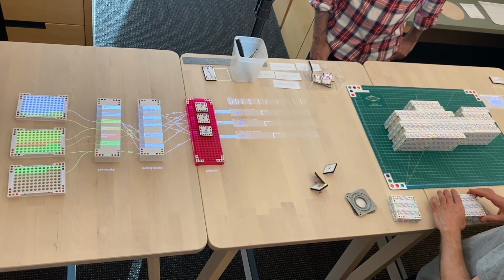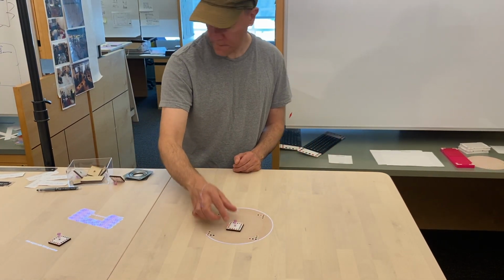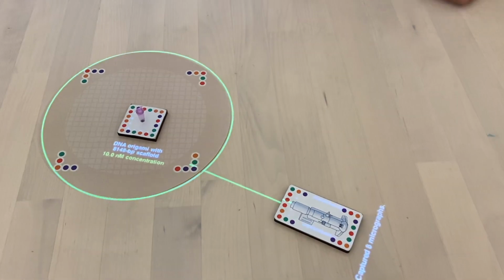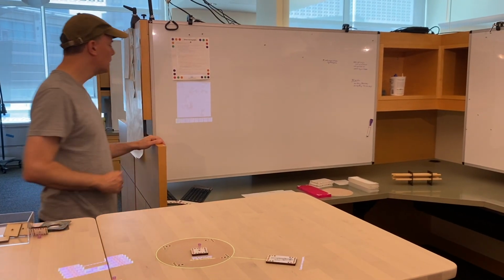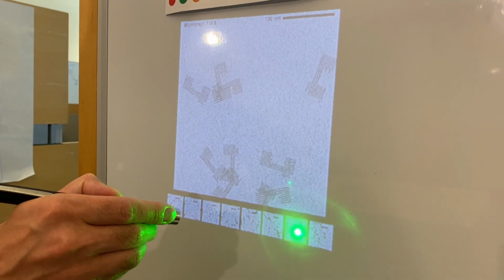Now our purpose in designing these origami structures is to be able to recognize them under the microscope. So here I'm putting down the mock EM grid, putting one of our mock tubes on it, and firing our mock electron beam at the grid. And this generates a set of simulated micrographs. Up on the wall, I'm pinning up the Show Micrographs program, and we're looking through our simulated images.